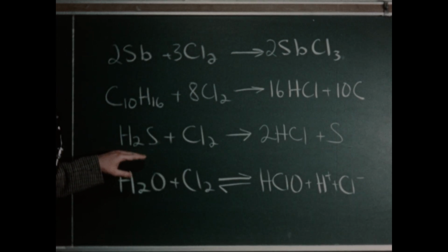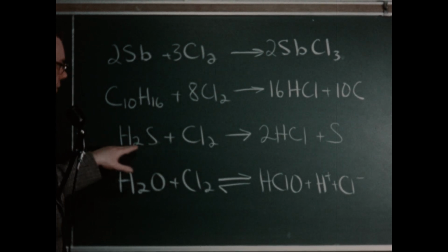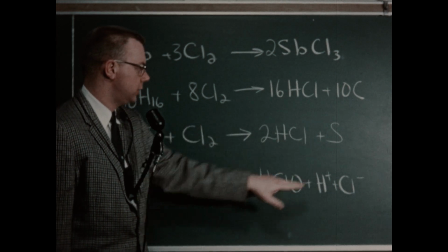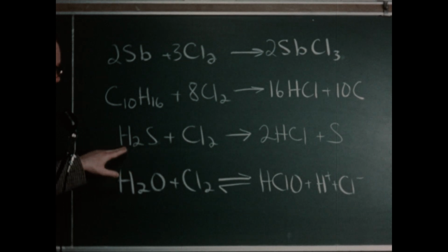When we added some hydrogen sulfide water to our chlorine, the solution became milky due to the presence of free sulfur, which is produced when chlorine acts as an oxidizing agent on the hydrogen sulfide.